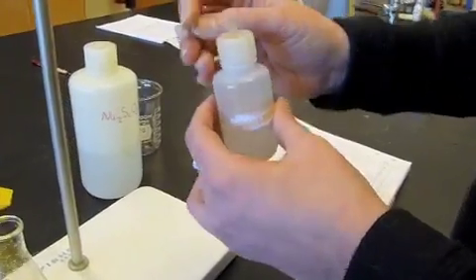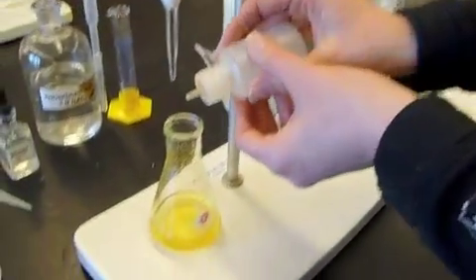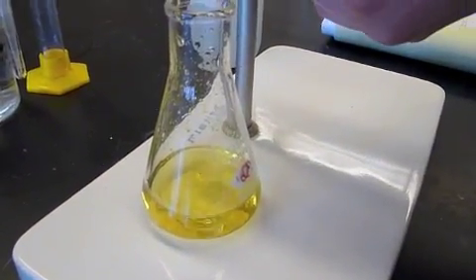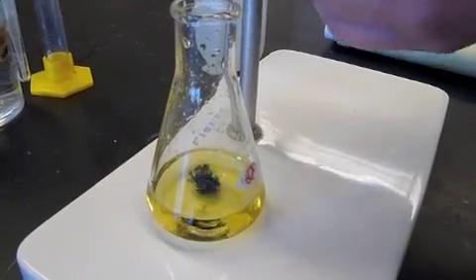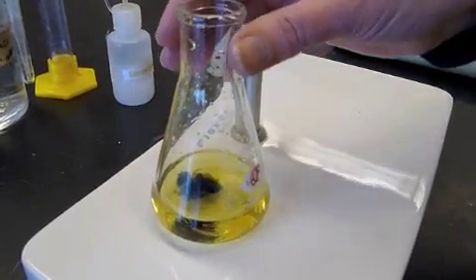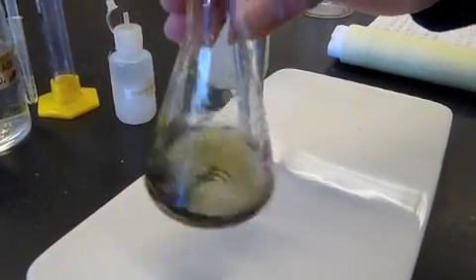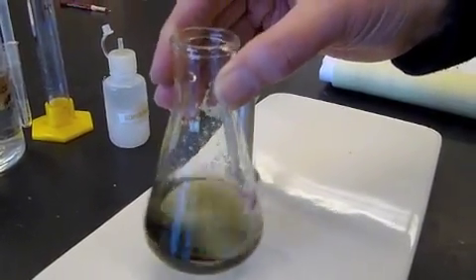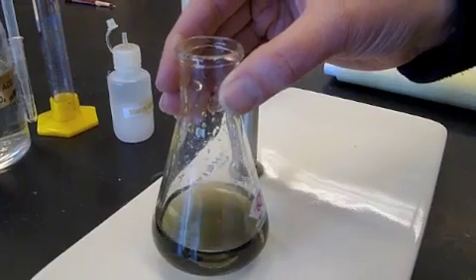To that we're going to take our starch indicator, and the reaction for this is kind of neat. And I'm going to add three to five drops, so I'm going to put two, three, three seem to do it. It looks like ink from a squid. I'm going to swirl it, and it's kind of a blue-black color.